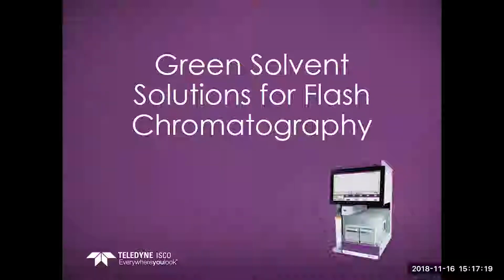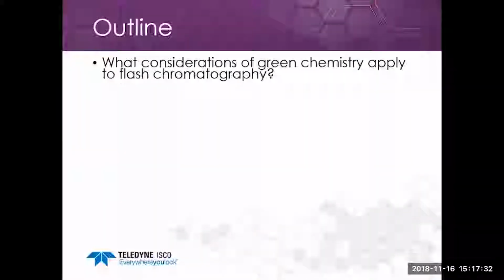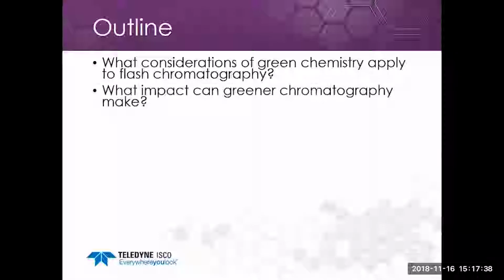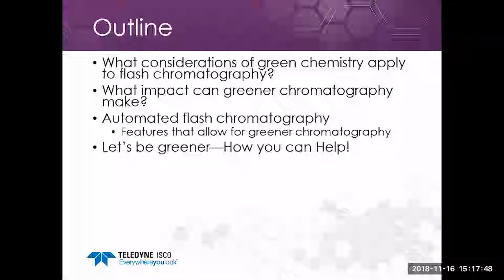Okay, thanks, Tori. So today, like Tori said, we're going to be talking about green solvent solutions for flash chromatography. We're going to be discussing considerations of green chemistry that apply to flash chromatography. What impact can greener chromatography make? How automated flash chromatography has features that allow for greener chromatography. And then finally, we'll discuss some more specific method development ideas about being greener and how you guys can help.